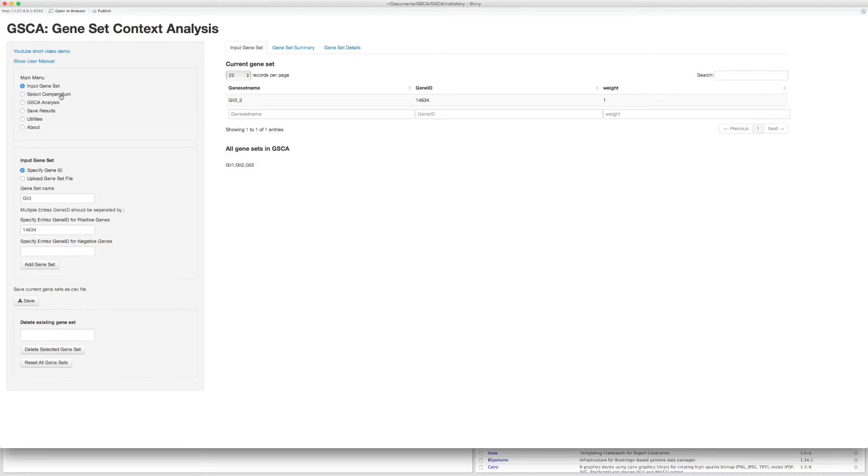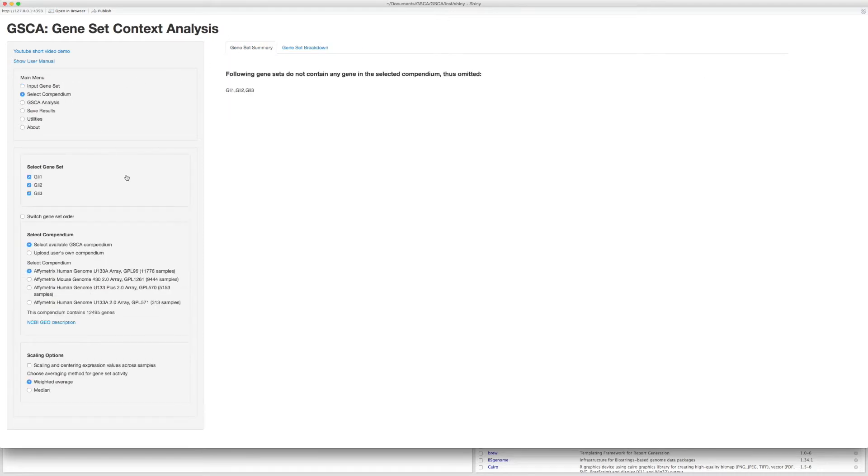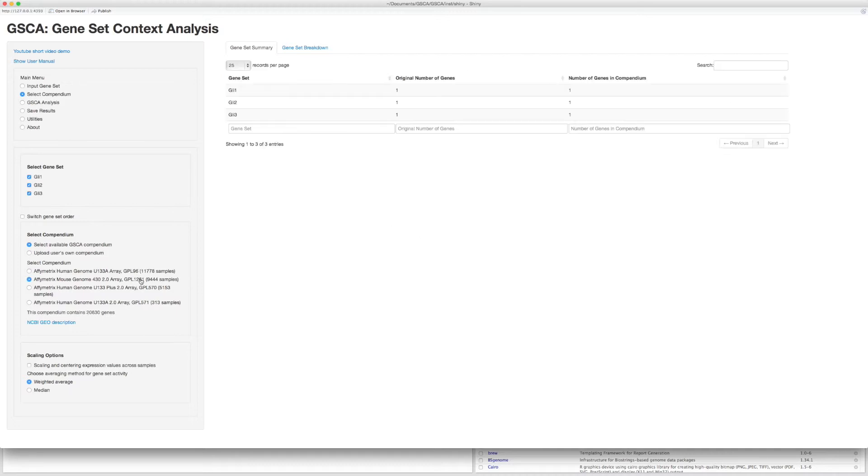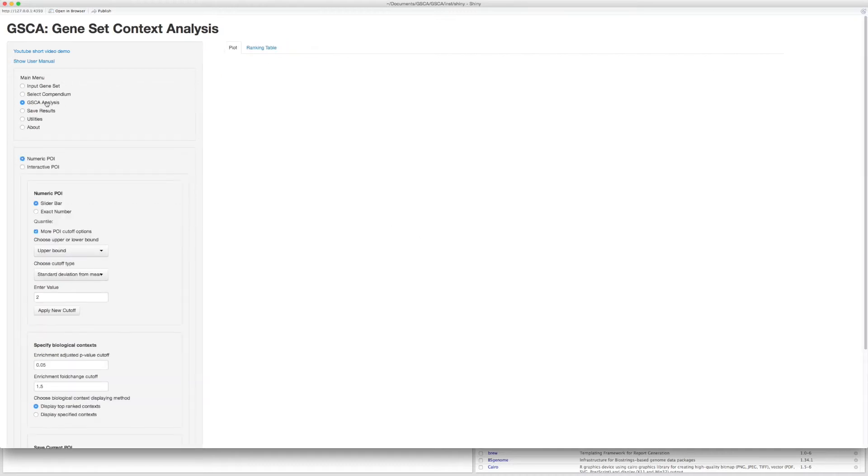Go to the second step to choose the mouse 430 array. Go to the third step to run GSCA analysis.